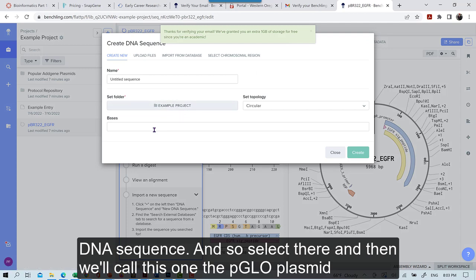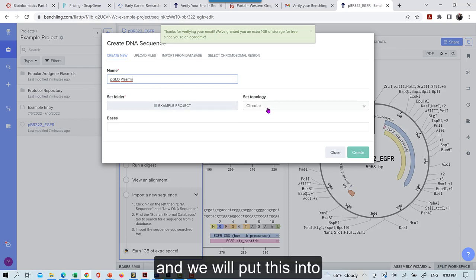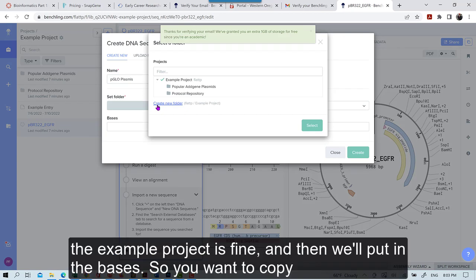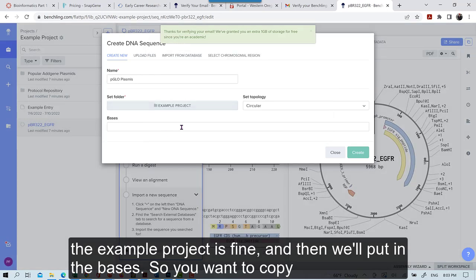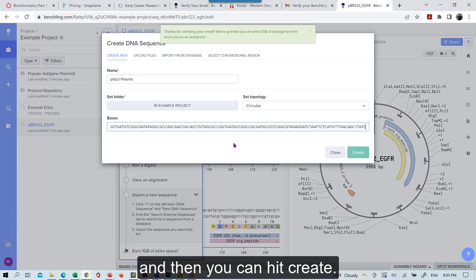And then we'll call this one the PGLO plasmid. And it's circular. And we will put this into the example project is fine. And then we'll put in the bases. So you want to copy paste this from canvas. And this is the entire sequence for that plasmid needs to go in there. And then you can hit create.